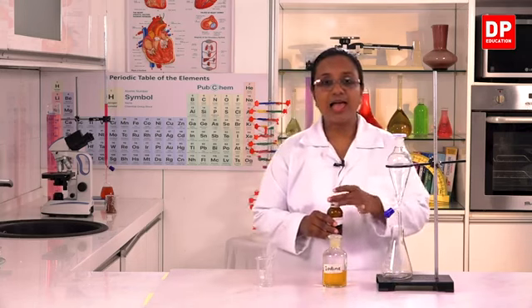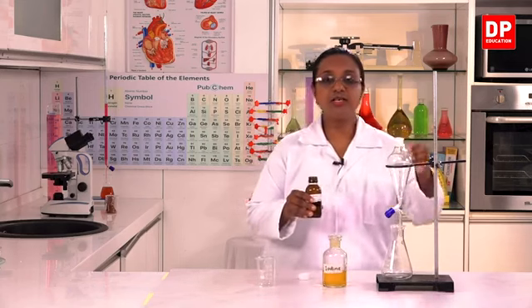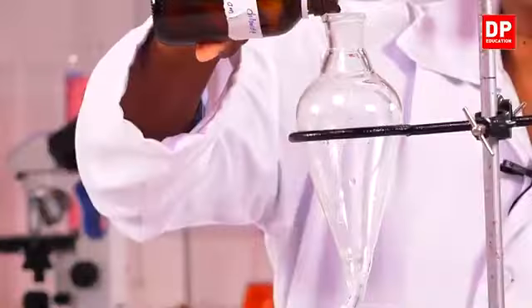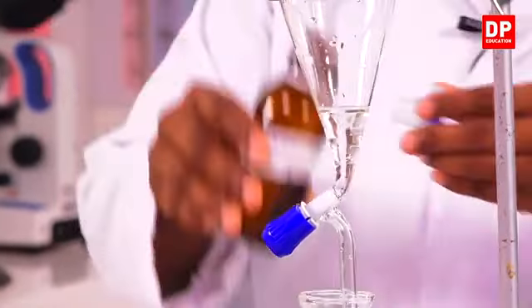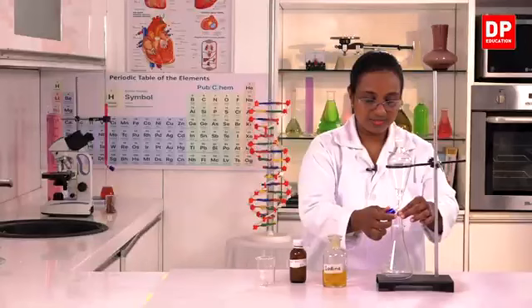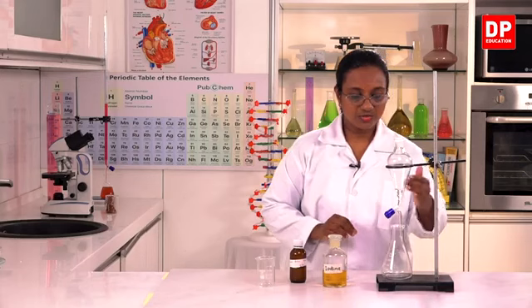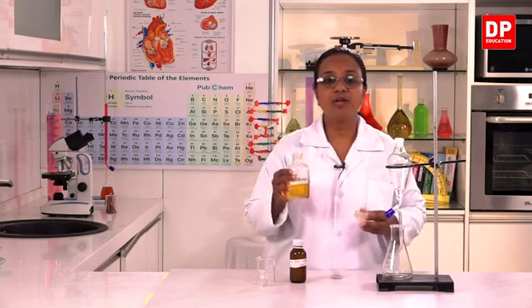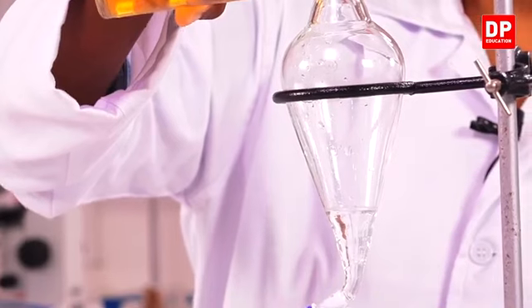So, now I will add a small amount of carbon tetrachloride into the separation funnel. You can see it is a colorless solvent. So, now I have the solvent inside and I have to make sure the tap is very tight so that the solvent does not leak. Then I add a small amount of iodine in water. So, here you can see the different colors.